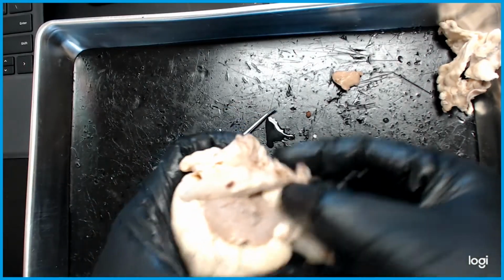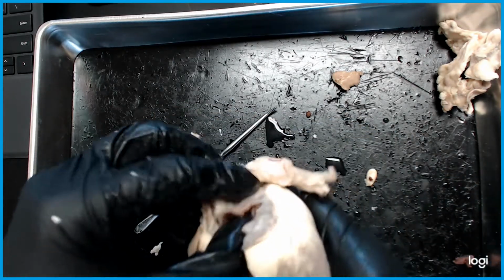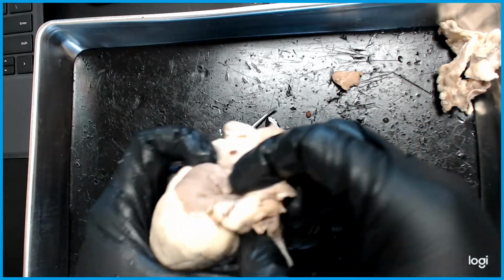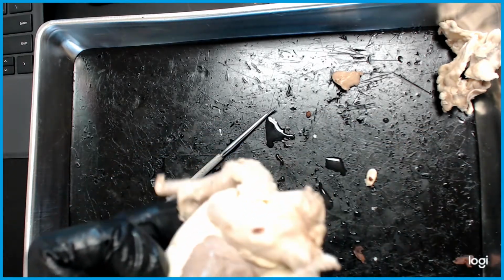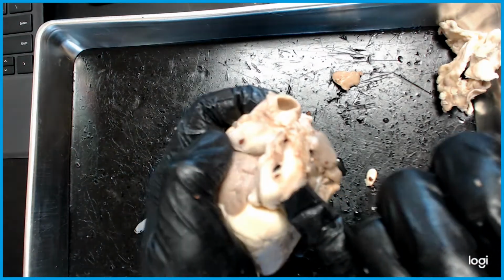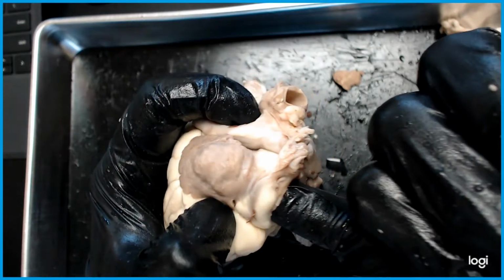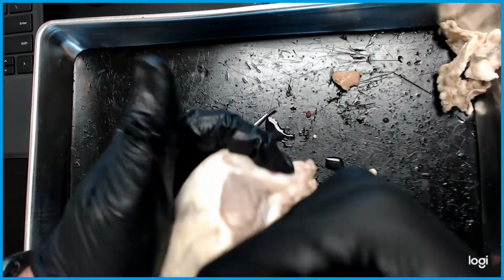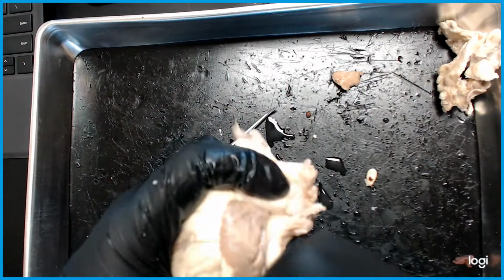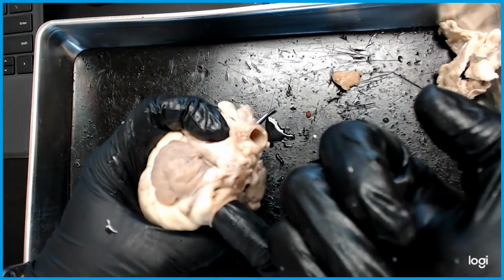Let's go over to the left side. With the left side, we know which one is the atrium, so now we can identify the atrium from the left side. That has to have an opening. That's coming from your pulmonary veins. Okay? If you look at them, there they are. So we're going to go right into here. Okay? And we're going to do the same thing. You're able to put your finger in, which we already did when we were trying to identify which cavities we could point out. So let's go and open that up.